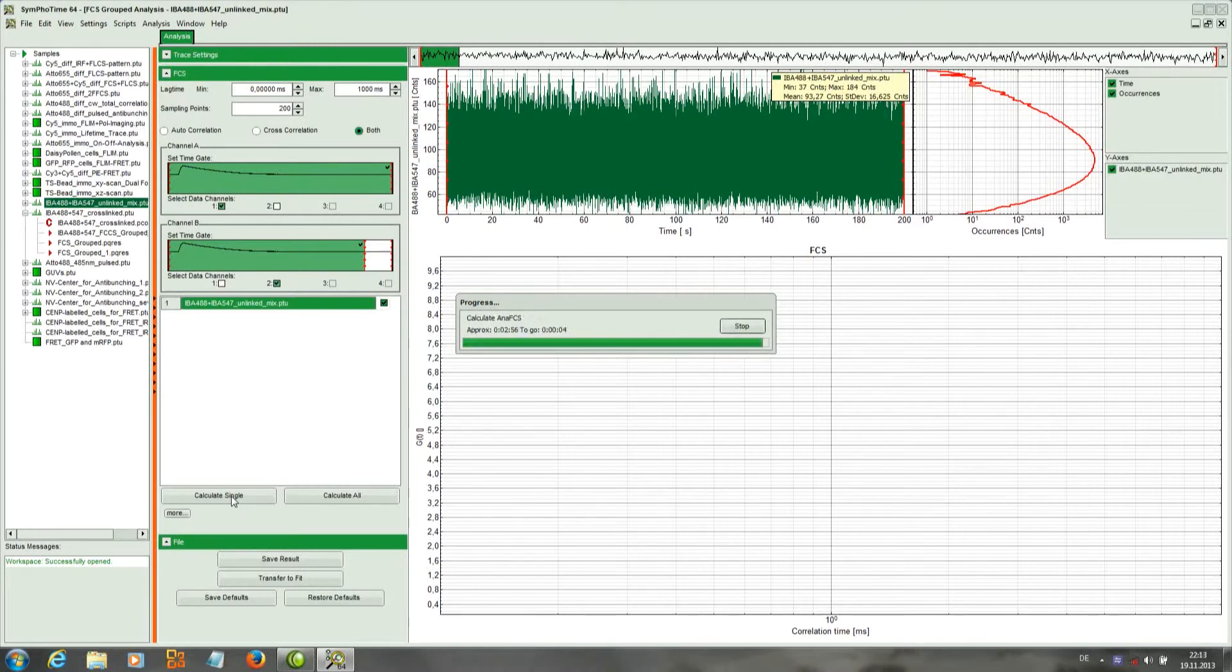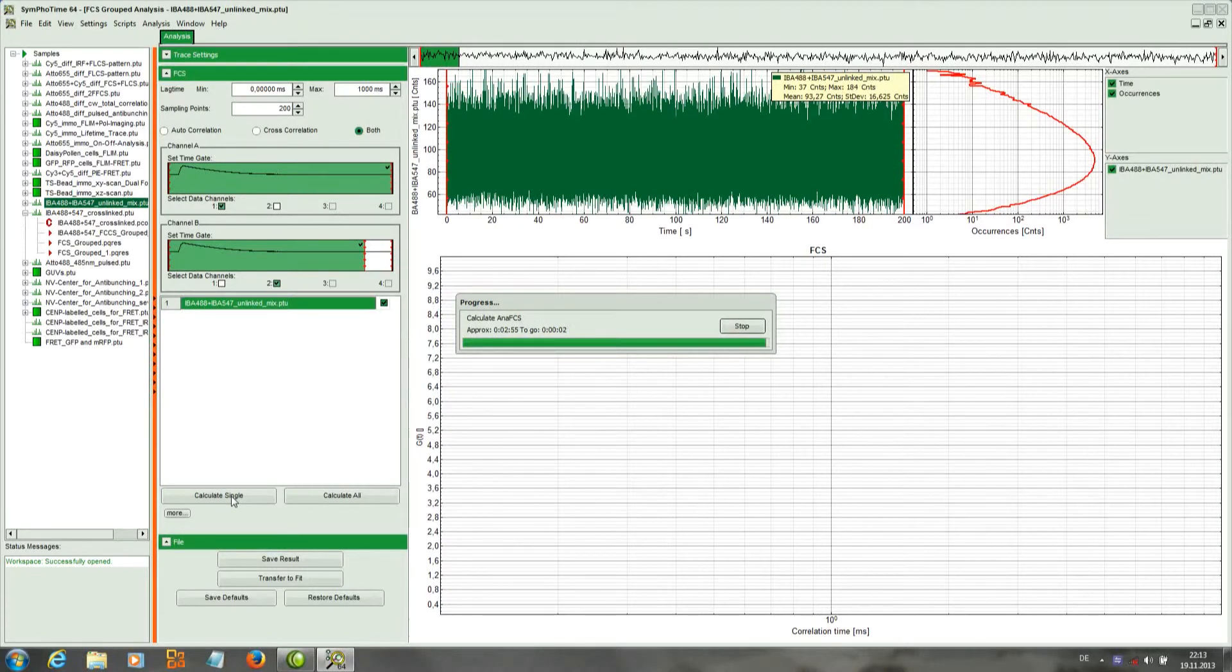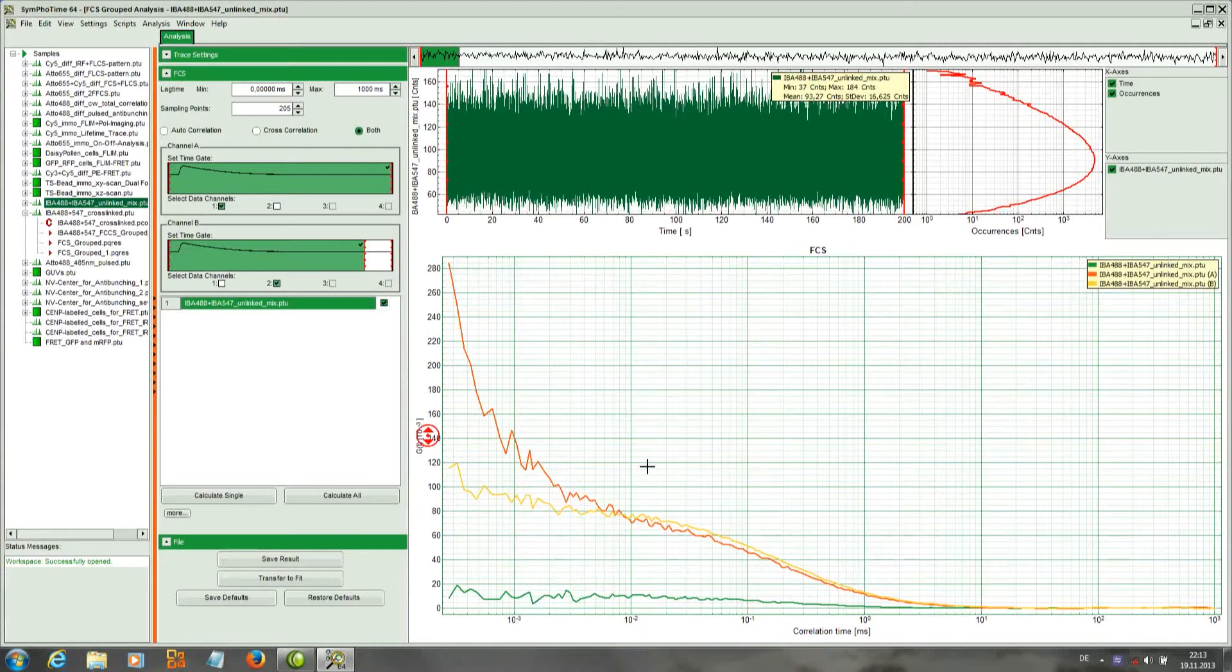Once the data is calculated, the curves appear here in this panel.